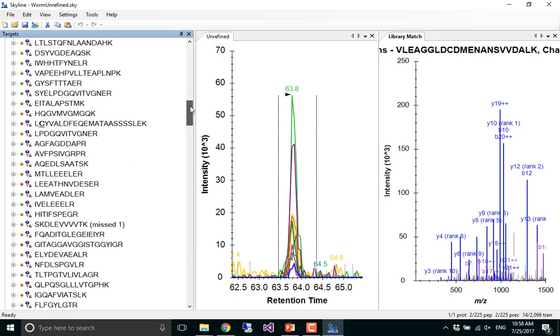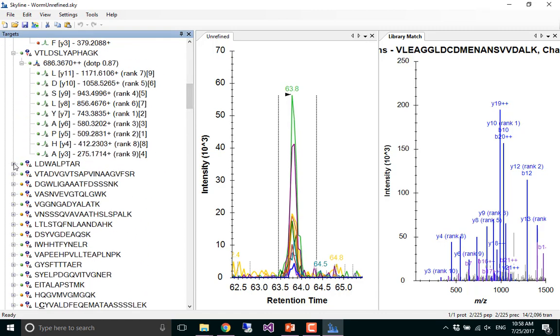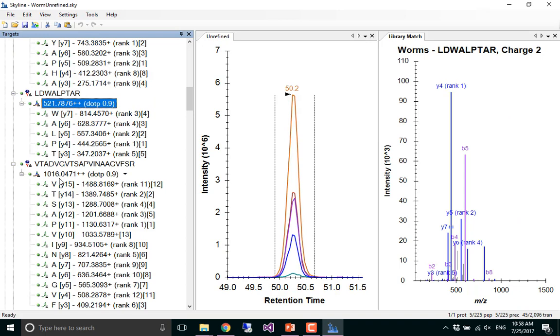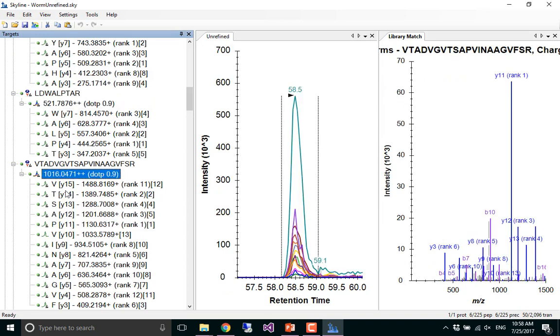So this is the idea: let's just look in our matrix and see what we think we can measure. You can see that already at the top there are a fair number of things that we could probably measure. Okay, but let's back up and re-import the data ourselves.